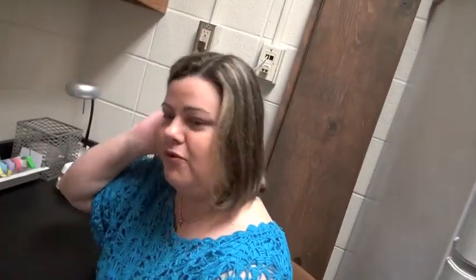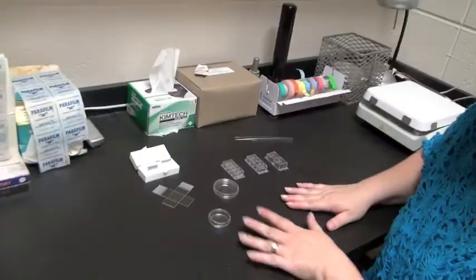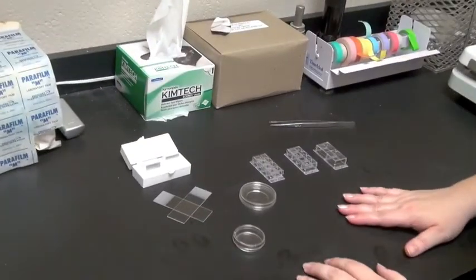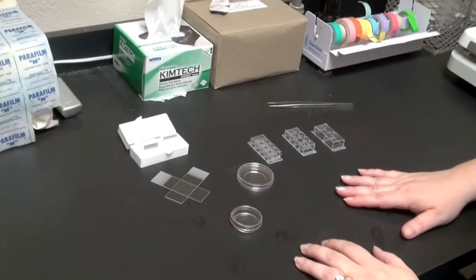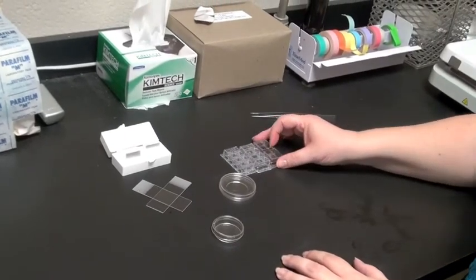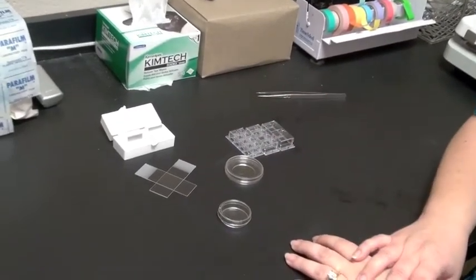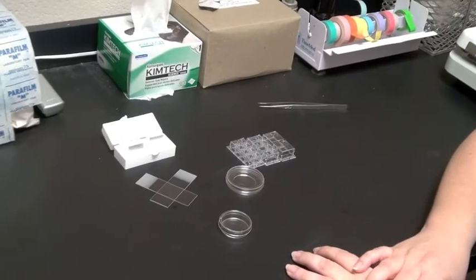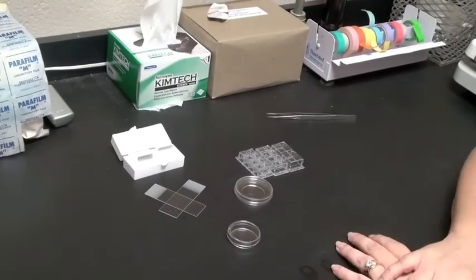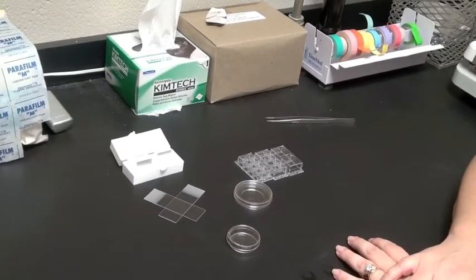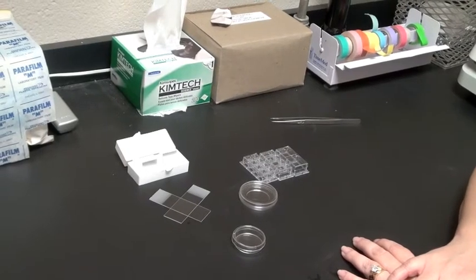So here on the table I have a variety of different types of cell chambers that you can use to grow cells in, as well as the traditional cover slip and slide. Depending on whether you're doing live cell imaging or fixed tissue imaging, it's going to make a difference in what you're going to need to use for your samples.